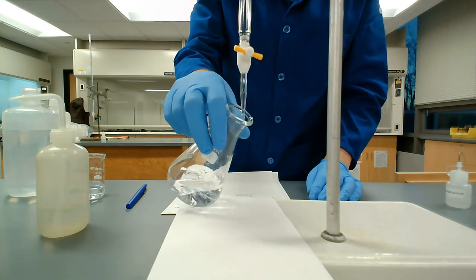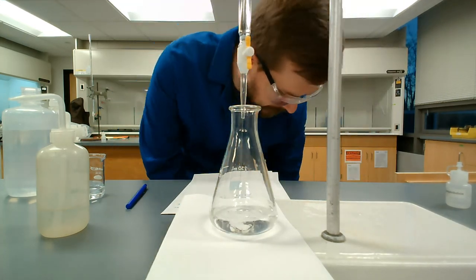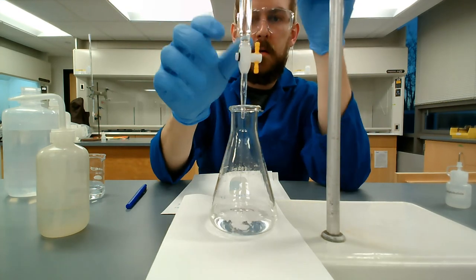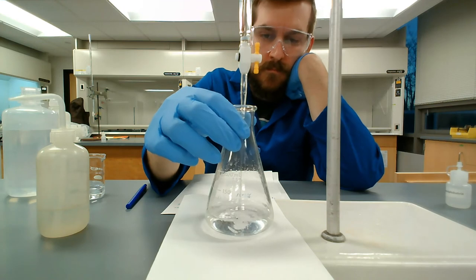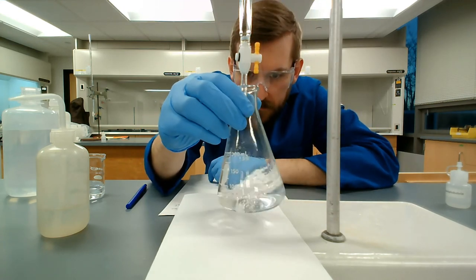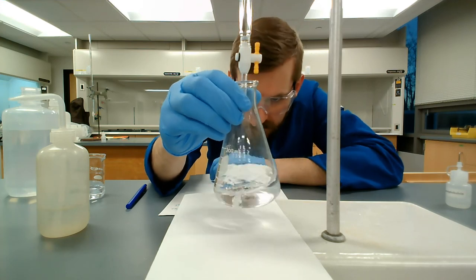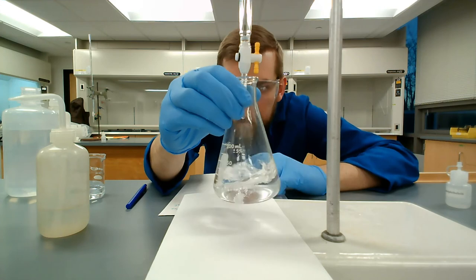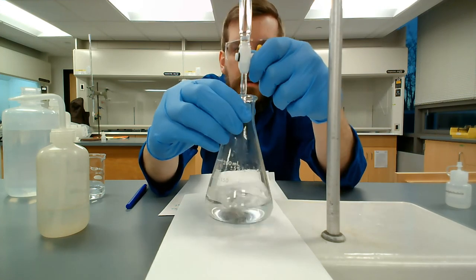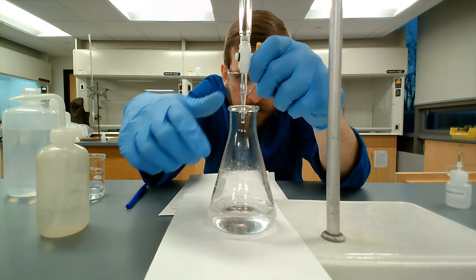So I still wrote down that previous trial that I screwed up, because I might not have screwed it up. I think I did, because I didn't get to the point where I added a drop and saw a color change. But I'm still recording it. It might still be an okay titration, depending on how it fits with the rest of the data set. So I recorded it and made a note of, hey, this might be a bad one. Because again, we should be going from no color in the Erlenmeyer flask at all to a faint pink color because we're using phenolphthalein indicator, right?